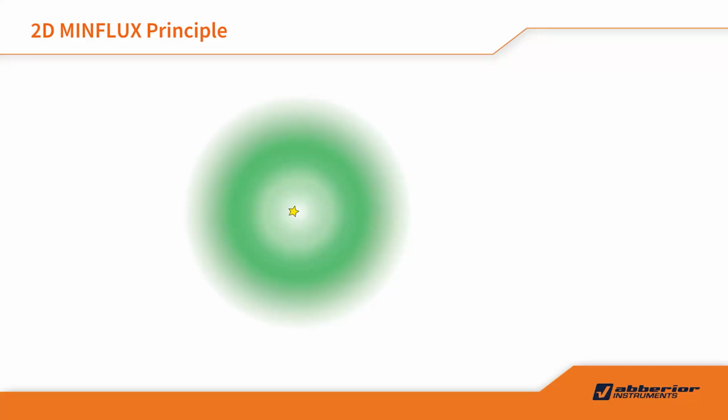As you can see here, boom, the microscope tries to deploy the excitation donut, to hit it with the center. If we are so lucky, then the center of the donut will hit the molecule, right? Then you know already from the STED part, in the donut center there's no energy, there's no excitation beam. So actually you see no signal on the detector.